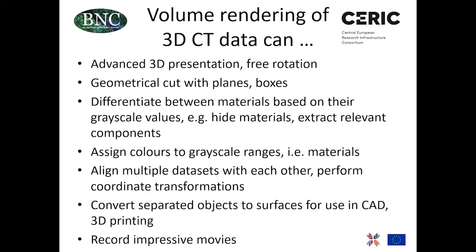Because in these programs, not only visualization is possible, but there are quantitative analysis features also, like pore size distribution measurement or surface determination, casting defects analysis, and so on and so on. So all these numerical data processing can be done on one or more data sets.